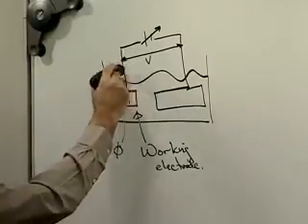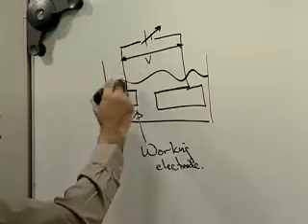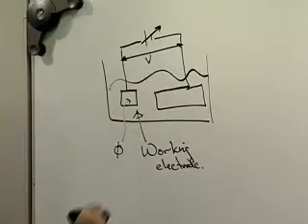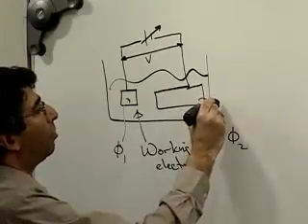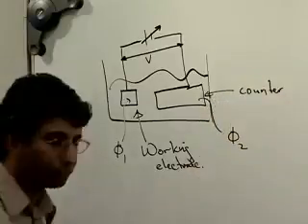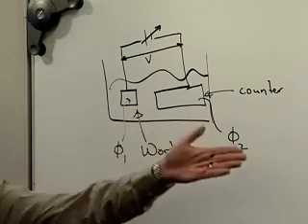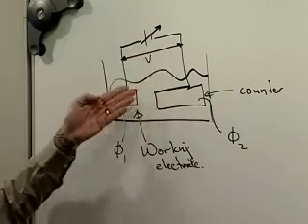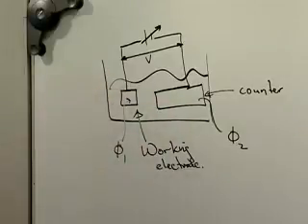Well, one way we might do that is we know what V is because we put it there. And so we might, zeroth order, say, okay, let's assume that the voltage is evenly distributed across these 2 electrodes. So we have a phi 1 for our working electrode and a phi 2 for our counter electrode. This is counter over here. And so V is just the difference in the potential of those 2. And if it was evenly distributed, then phi 1 and phi 2 would be equal. And so if I put 10 volts across there, then it's 5 volts over here and 5 volts over there. And I know that this is at 5 volts, my working electrode, and so I have some control now.